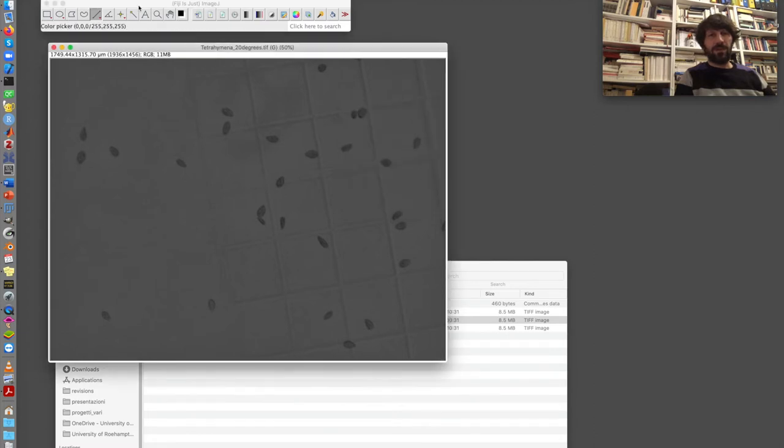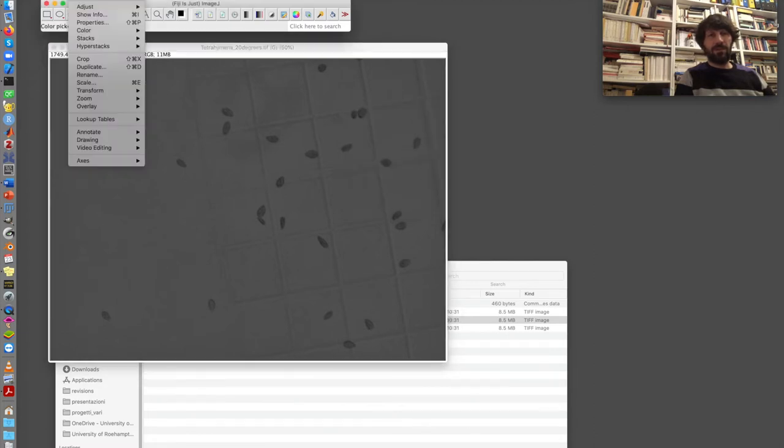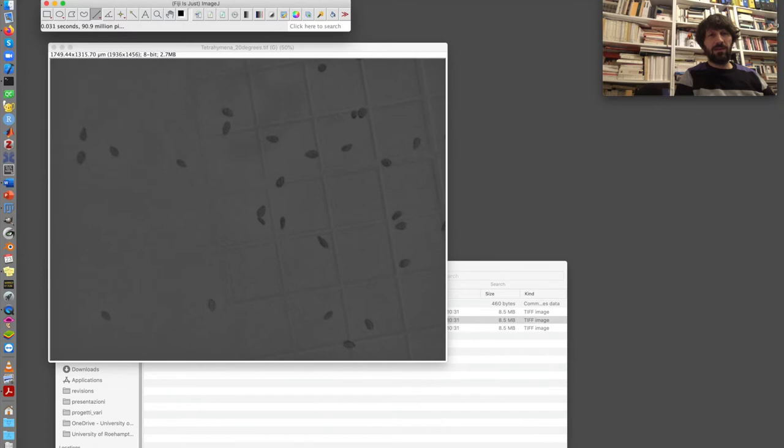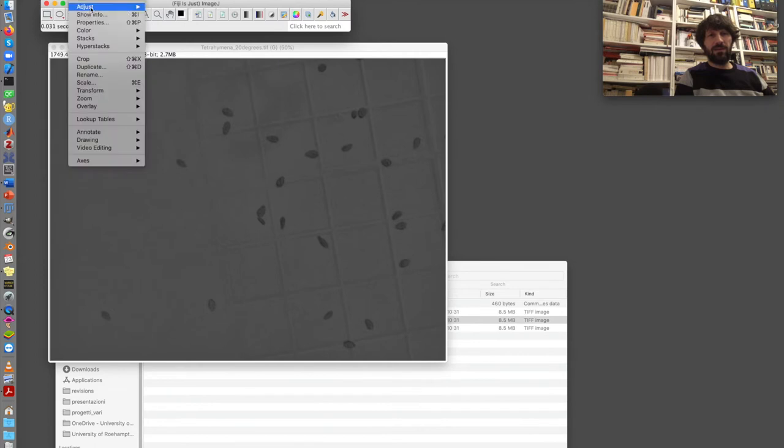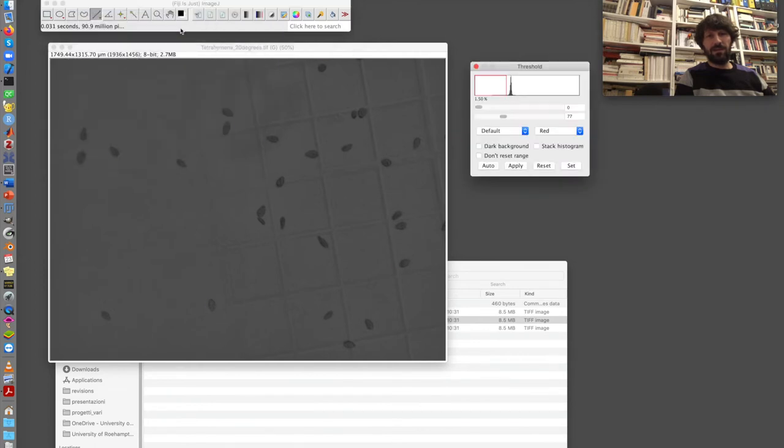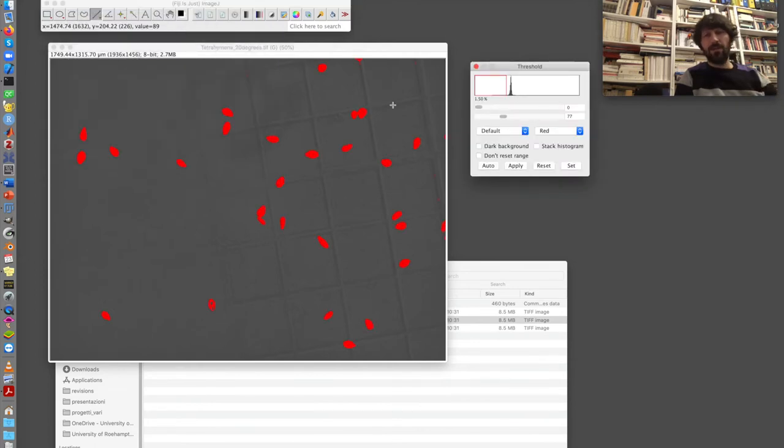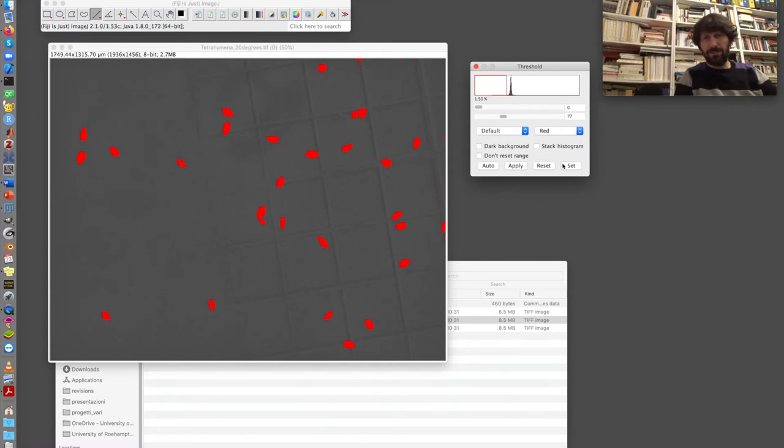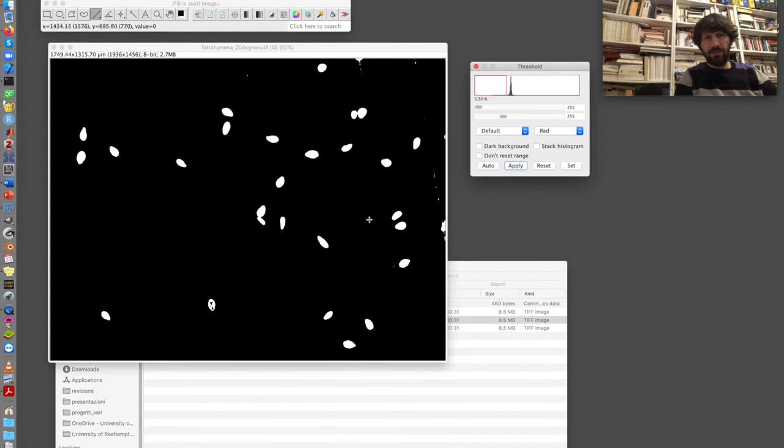So again, image type 8-bit, image adjust threshold. Good. Here. I'm going ahead and segmenting this. Apply.